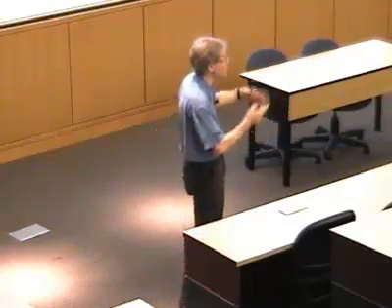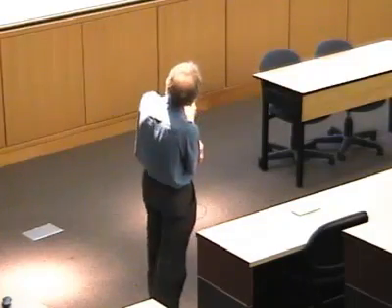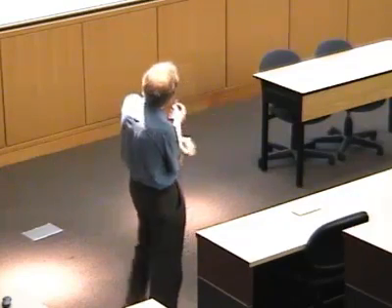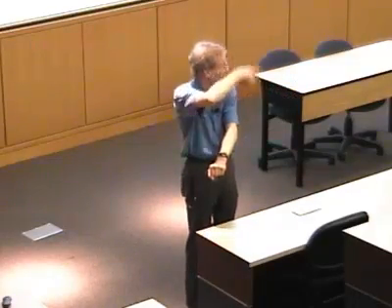So let's talk about kind of what you need to do. Now, this will be kind of the essence of our tutorial session, going over this, but just to give you a little bit of a preview, okay? First thing you'll need to do is adjust the baseline, make sure that you're actually integrating all the area of the peaks that you've got there, okay? You'll have to subtract this heat of dilution, okay? Now, there are two ways to do this. I mentioned one where you look at this extended region out here, and that's your heat of dilution for the actual experiment. Another way to do that is to run a control titration, where you take the macromolecule out of the cell and just add your titrant, okay?